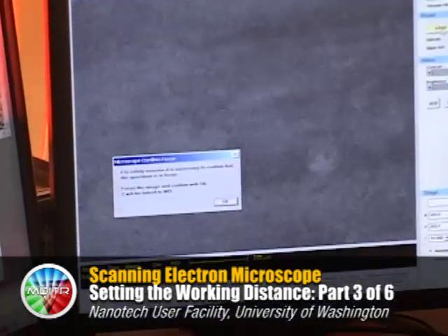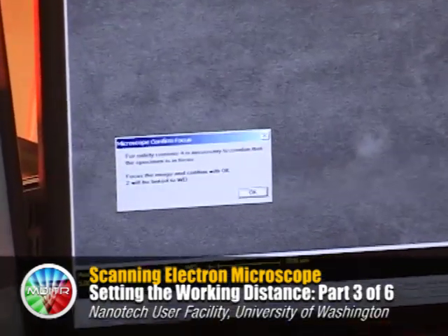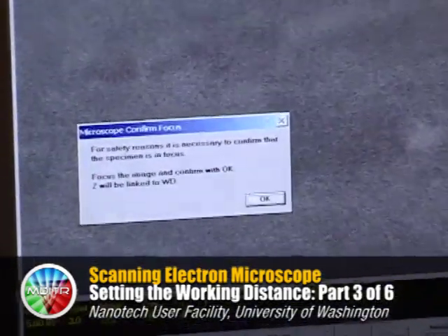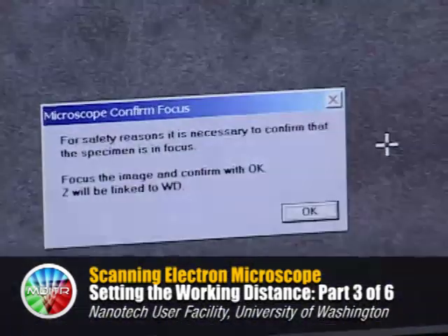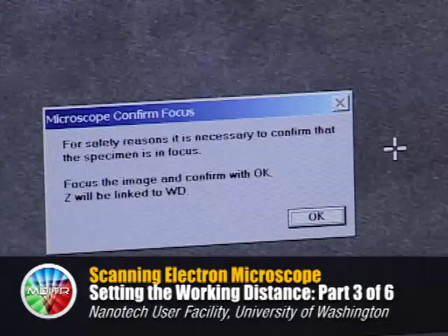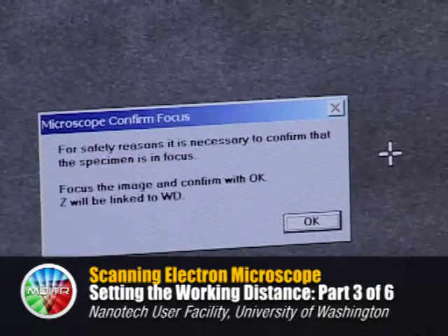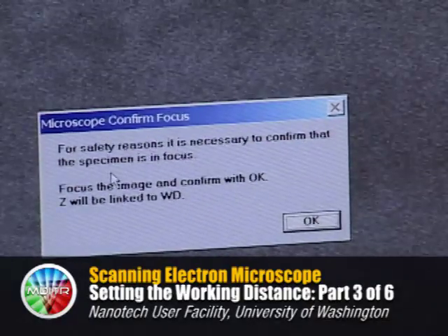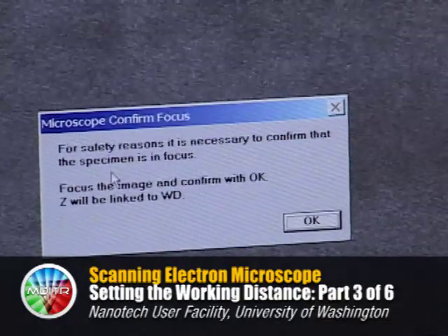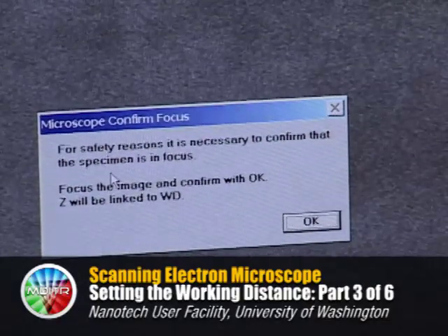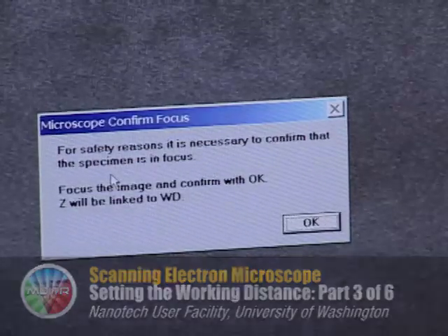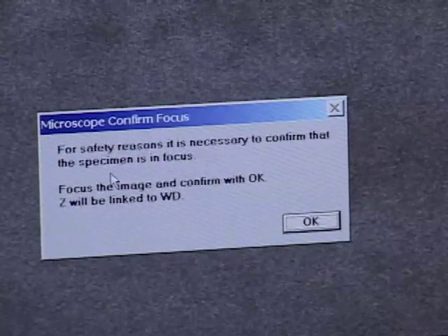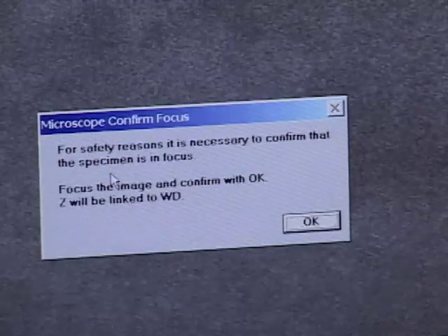When you open the column valve and the beam starts to hit the sample, you'll also see this microscope confirm focus box. The computer doesn't know how tall the sample we put in the chamber is, and so it doesn't know how much clearance we have at this time.